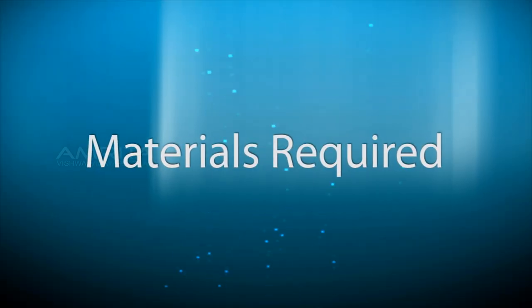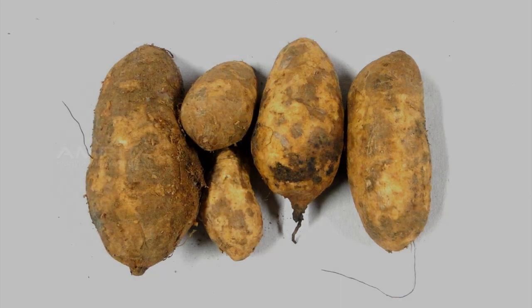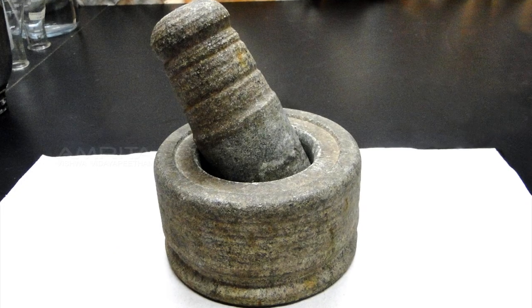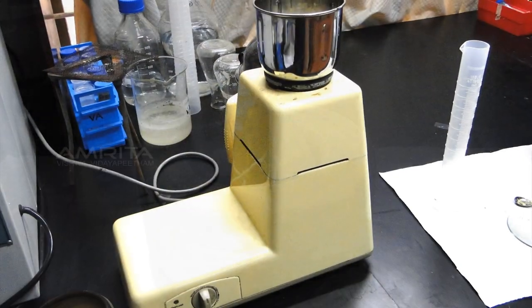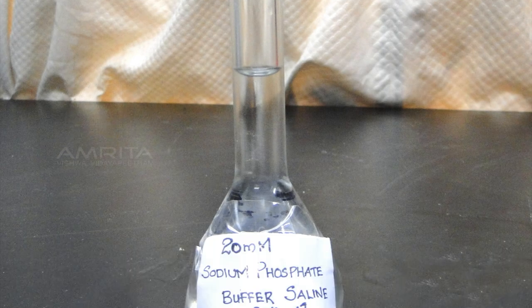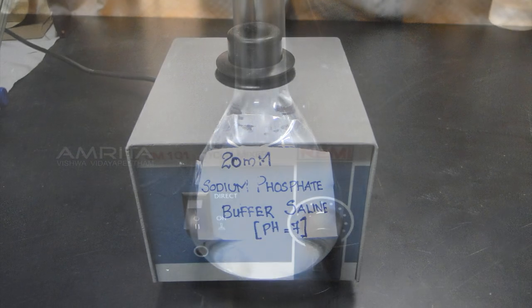Materials required: sweet potato, knife or peeler, mortar and pestle, blender, blue capped tubes, 20 mM sodium phosphate buffer at pH 7, and a vortex mixer.